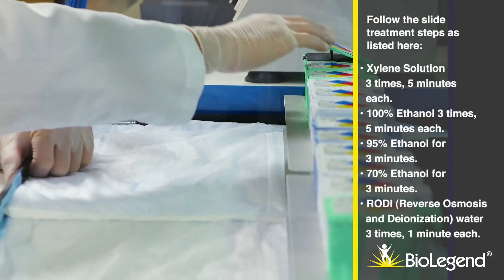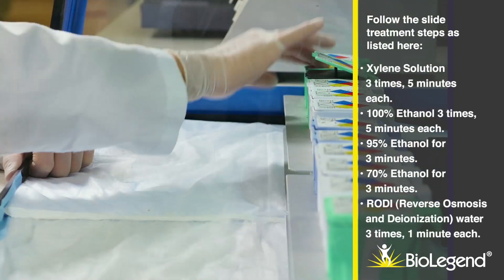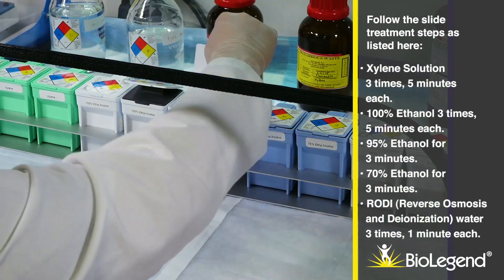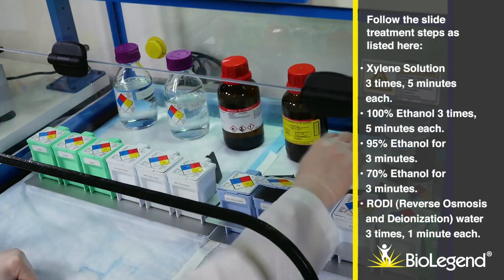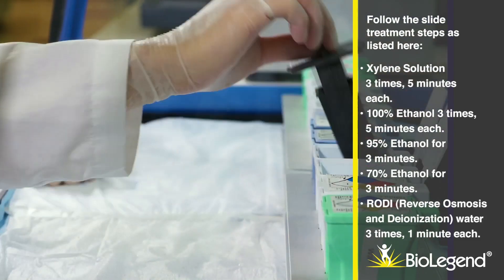Follow the slide treatment steps as listed here. Xylene solution 3 times, 5 minutes each. 100% ethanol 3 times, 5 minutes each. 95% ethanol for 3 minutes. 70% ethanol for 3 minutes. RODI reverse osmosis and deionization water 3 times, 1 minute each.